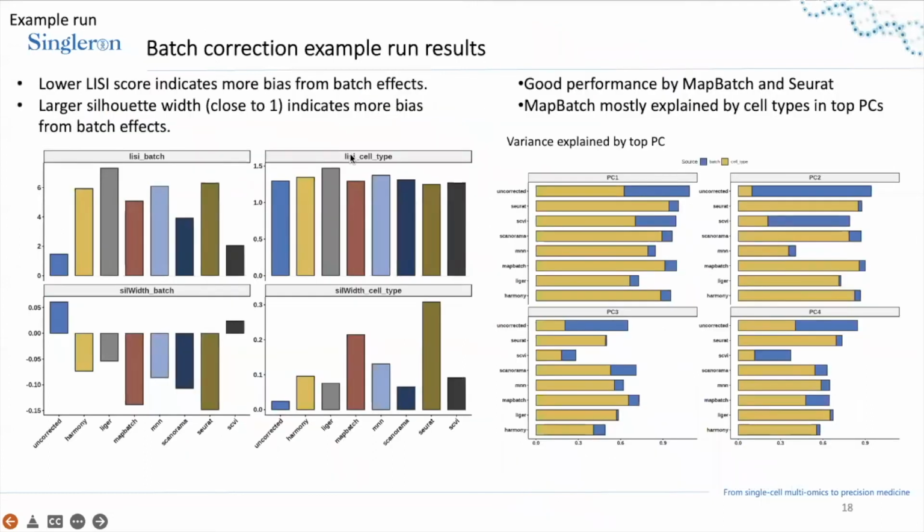So when we group and show all of the results from the 7 batch correction tools together, we can observe that for this specific sample, for example, the mini benchmark, the cells are relatively simple. They are all PBMCs or bone marrow. So there are no very complicated differences in this sample. And the only small difference that happens here may be the disease samples versus the normal samples, these two disease samples that are different.